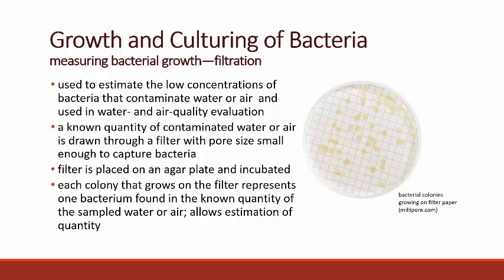Then you slide that piece of filter paper onto an agar plate and incubate it. Each colony that you see will be representative of one bacterium found in that known quantity of water or air that's been sampled. So again, it's all about estimating.